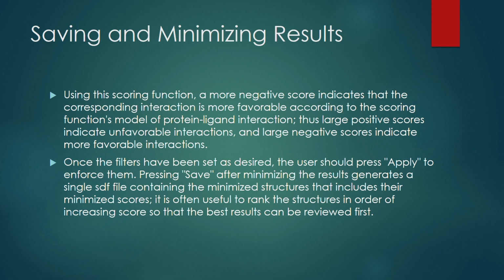The minimized results contain structures based on the scoring function, with the most negative scores displayed first, and the file is generated as a single file in SDF format.